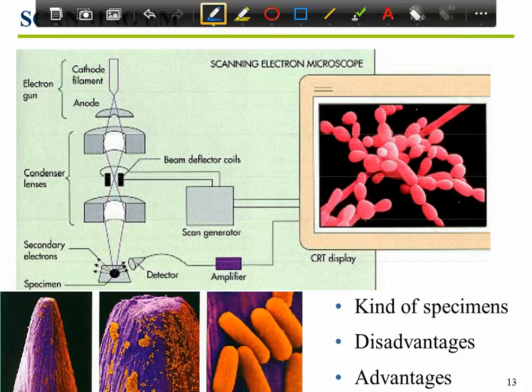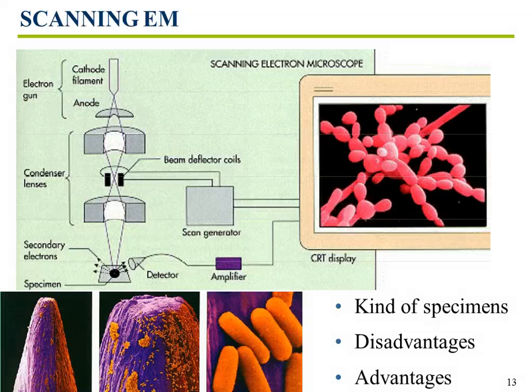It's much easier to use. In fact, we have a scanning EM that they use down in the tech area where they're doing things like wafers for computers and things like that for TI. TI has some of the scanning EMs also. Again, I've already given you the disadvantages. And again, the advantages: if you only want an external view and you want something easier to use, then a scanning EM is much better.